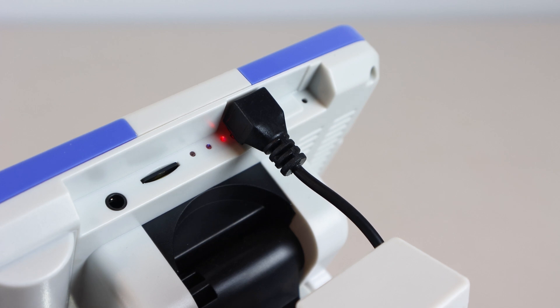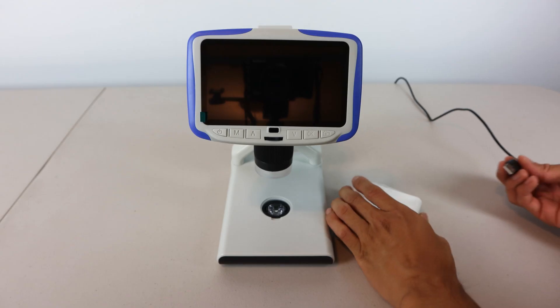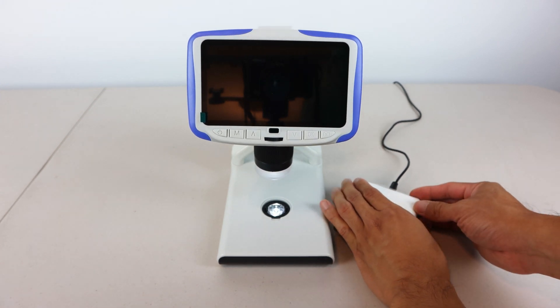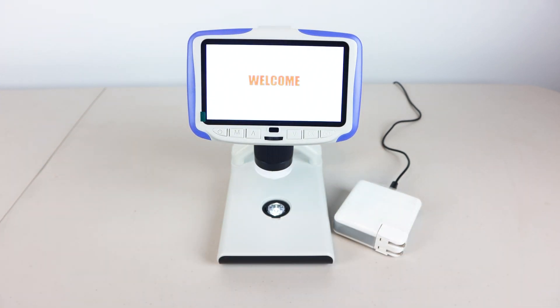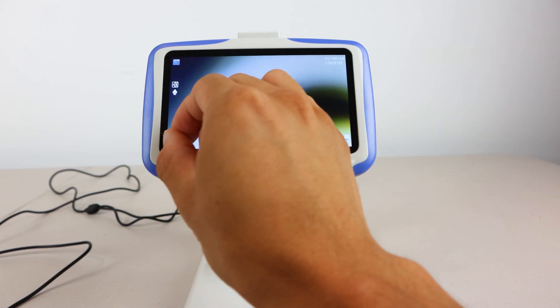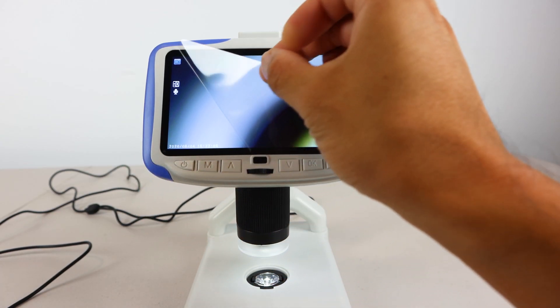This microscope can operate unplugged from the wall for several hours on a full charge. When plugged into a power source, the microscope will automatically turn on the LCD and the LED light in the base. For best viewing, peel off the plastic screen protector from the LCD first.